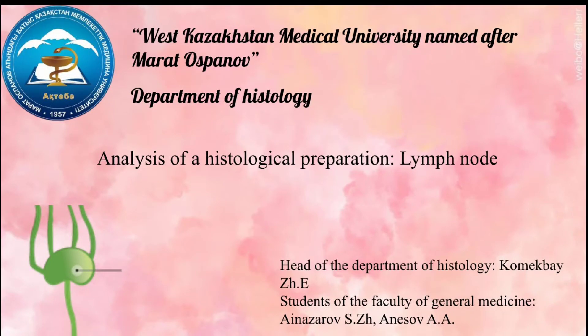Hello, dear students! Let's talk about the histological structure of the lymph node, as seen on a slide stained by hematoxylin and eosin.